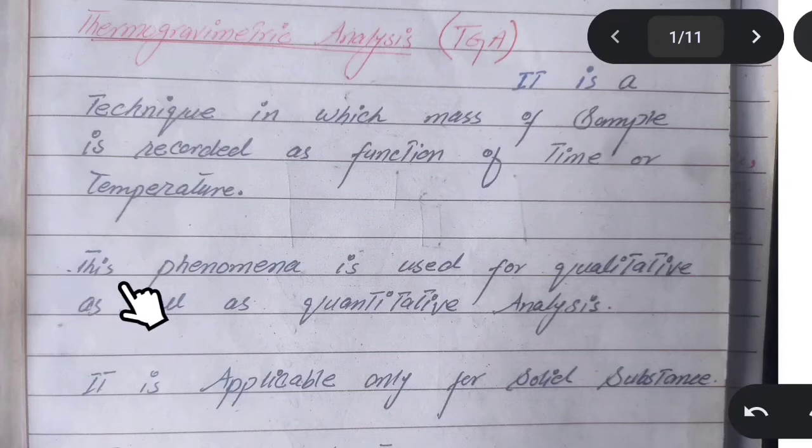So the next point is that this phenomenon is used for qualitative as well as quantitative analysis. By using a thermogravimetric technique, we can measure the quality. Quality is actually a term referring to the identification of the components or constituents of a substance. Got it?